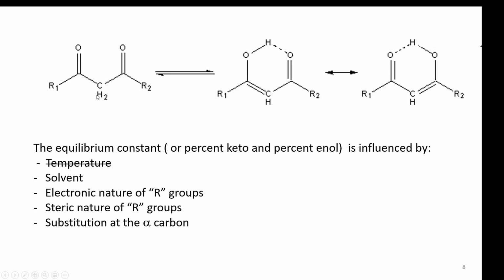So what about the substituent to this carbon here? So we are going to use the different molecules, different solvents to explore how they're gonna affect the equilibrium constant.